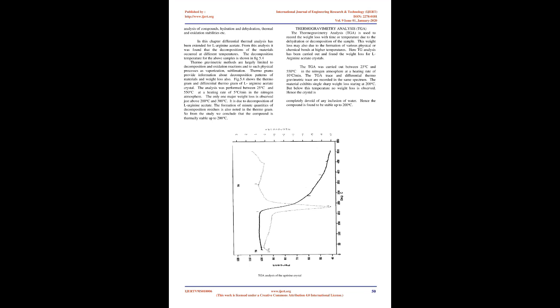Thermal studies. We know that a solid crystal is an assembly of atoms held together in a periodic array by certain binding forces. So, if we increase the temperature of the substance, there is an average increase of interatomic distance, i.e., thermal expansion will take place. Magnetic behavior also depends on temperature. The materials were classified as diamagnetic, paramagnetic, and ferromagnetic materials. From this we clearly understood that temperature has a major role in solid-state physics. Hence the analysis of materials at different temperatures is an essential factor, called thermal studies. From this thermal analysis we can locate the operating temperature range for a number of applications.